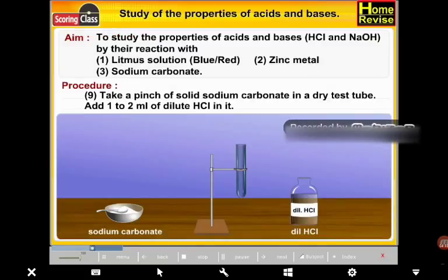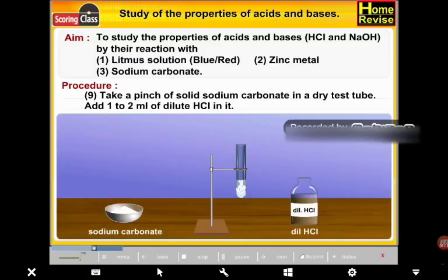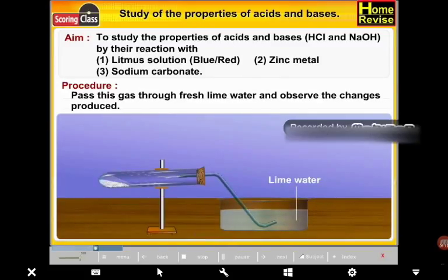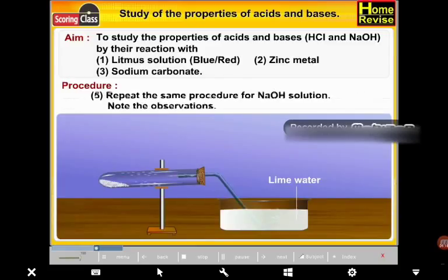Take a pinch of solid sodium carbonate in a dry test tube. Add 1 to 2 ml of dilute HCl to it. A vigorous reaction starts. Note the color of the gas evolved. Pass this gas through fresh lime water and observe the changes produced. Repeat the same procedure for NaOH solution.